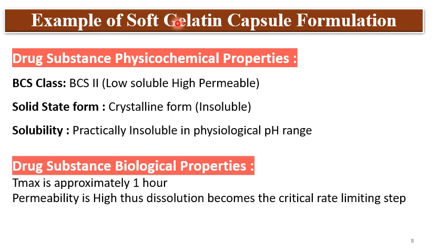Then the example of soft gelatin capsule formulation I have taken to get an in-depth understanding of the clinically relevant specification and the discriminatory dissolution specification. So these two things are related and these are not separate things. So from discriminatory dissolution we are going to the clinically relevant specification. See, here the example is hypothetical and from this hypothetical example we will understand the relevance of the formulation, drug substance, process, specification and the clinical output.